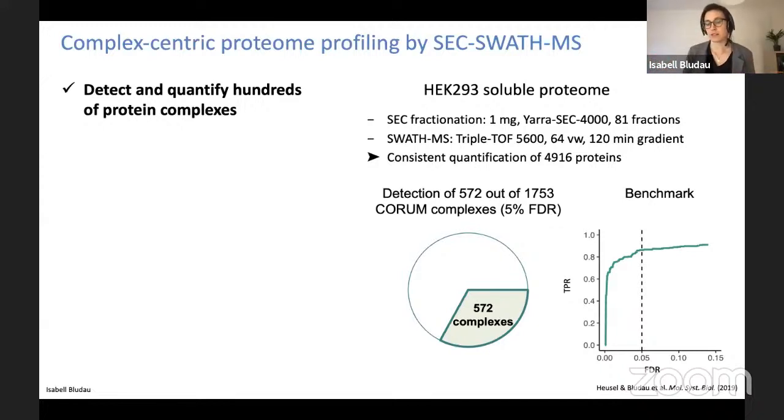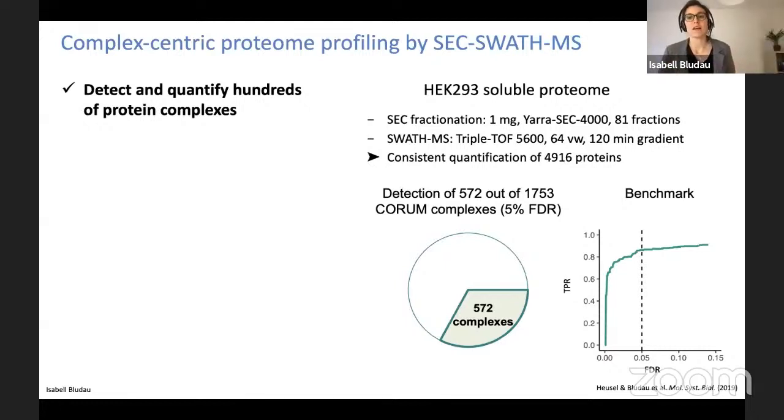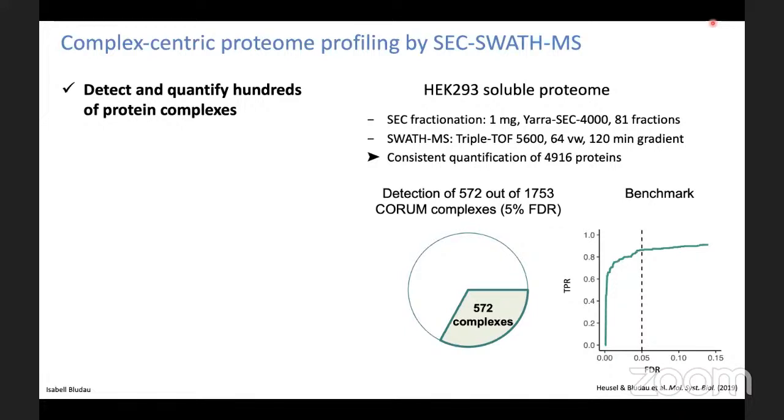And then we take the SEC information as a better way to look at whether the peptide is confidently there or not, because what we expect are these really smooth elution profiles for the peptides, and that the peptides, as I said, correlate well with each other from the same protein. So if this is not the case and the protein has been, for example, quantified by noise in a lot of fractions, then we will filter it out during this filtering step. But yeah, it's a good question.